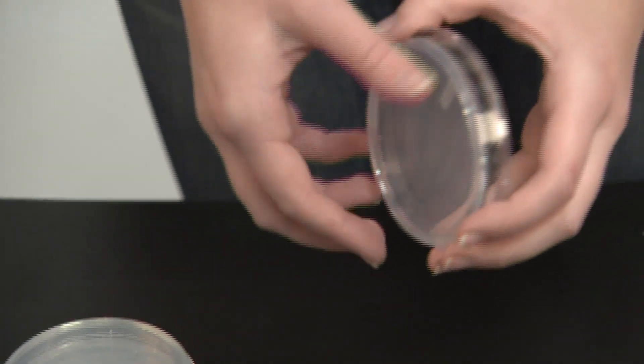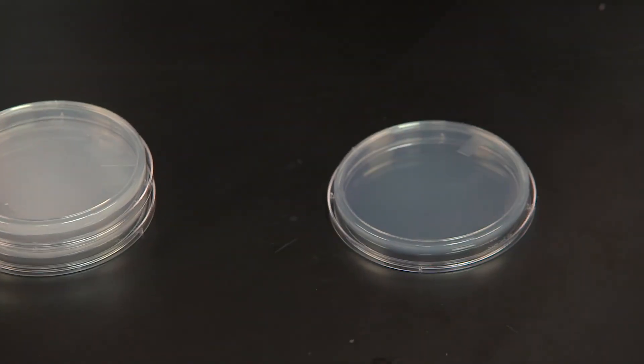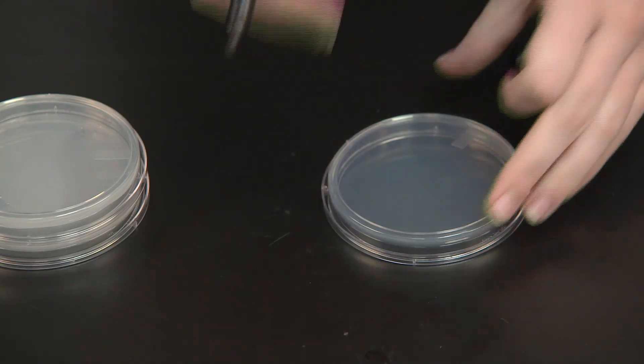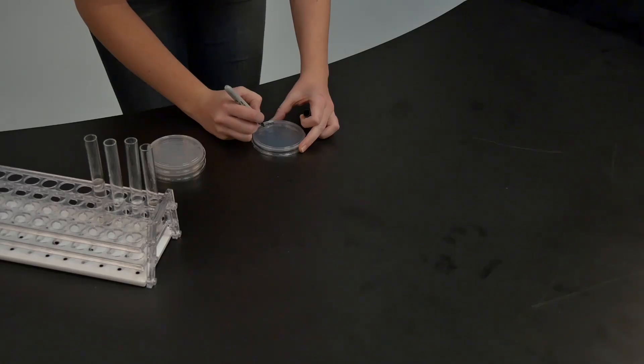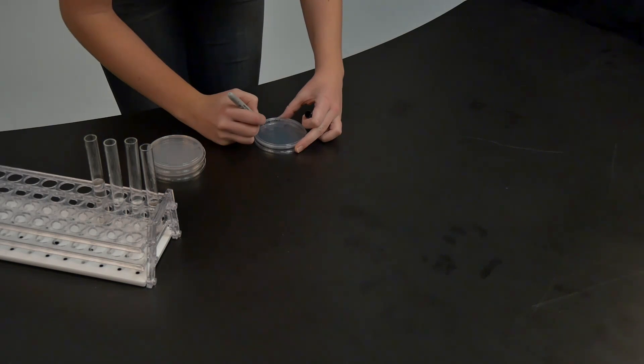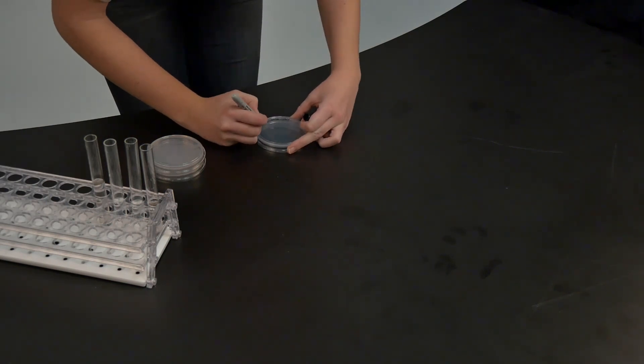First, let's label each of our plates. We ask that you write your information on the bottom of the plate and never on the lid because sometimes lids can come off or be switched. Please write small and along the edge of the plate so as not to prevent your ability to see the bacteria growing.